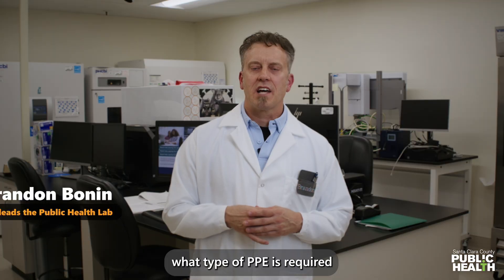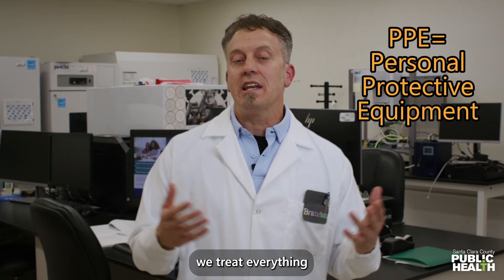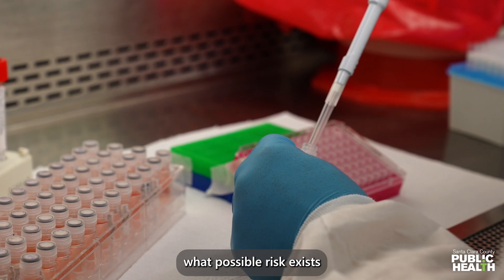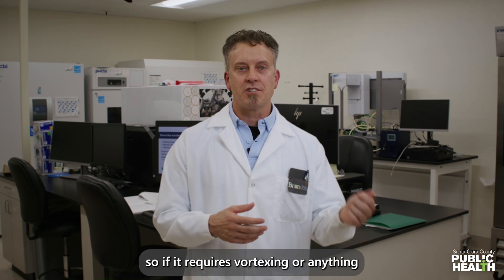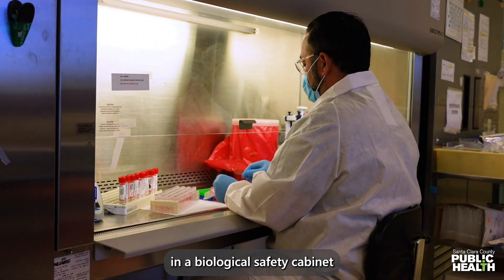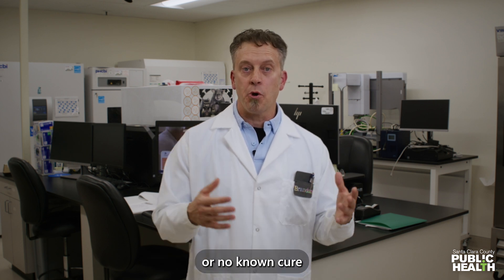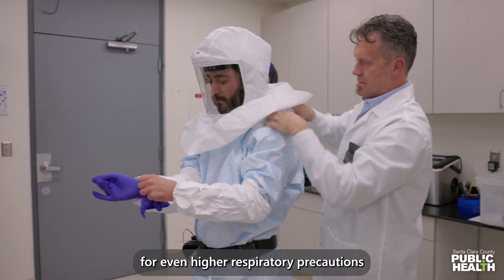The way we determine what type of PPE is required is by doing what's called a risk assessment. We treat everything as possibly infectious and use universal precautions, identifying possible risks with testing a patient or sample. If it requires vortexing or anything that might create an aerosol, all that is done in a biological safety cabinet. If the organism we are testing has a possibility for lethality or no known cure, that gets stepped up to our level three laboratory for even higher respiratory precautions.